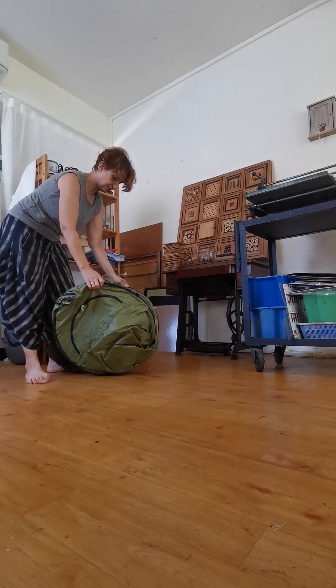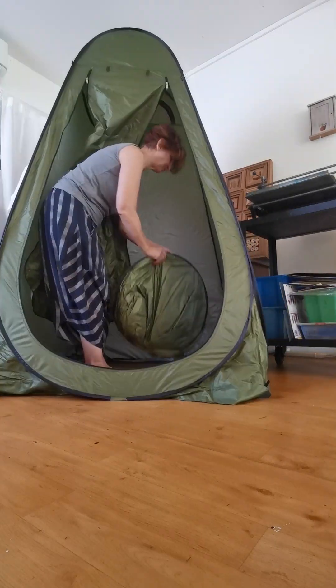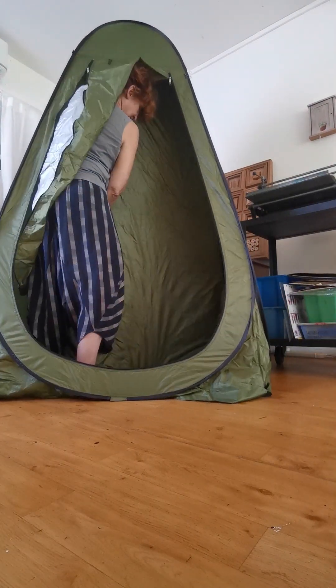First you pitch the dark room tent. You can use two for better darkness.